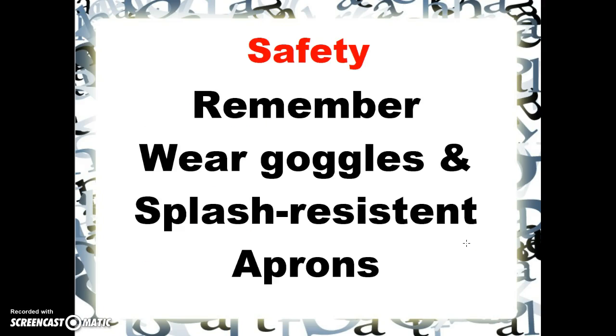Remember, when you're doing such a laboratory, to wear the proper protective gear, because these acids are dangerous, especially to your eyes, but even to your skin and clothing. So be very careful when you do this.